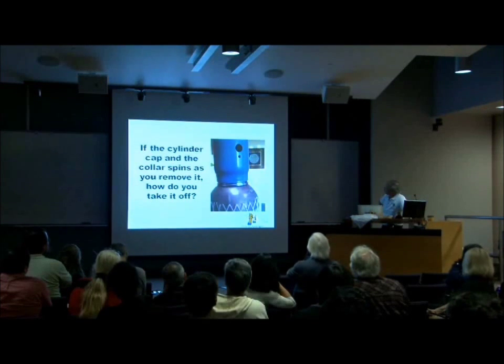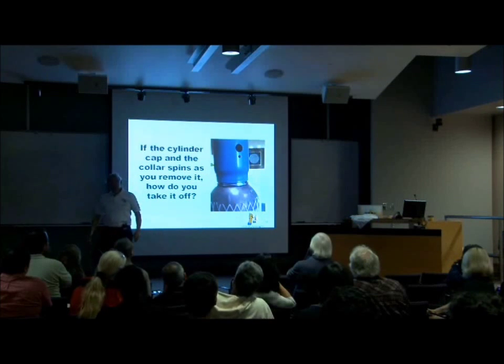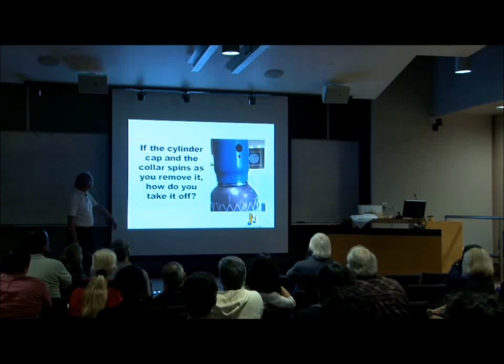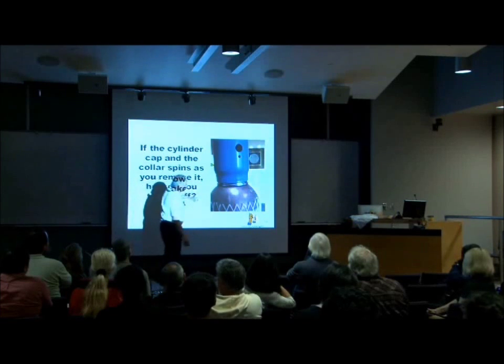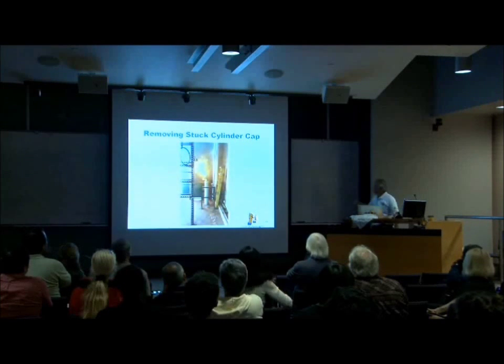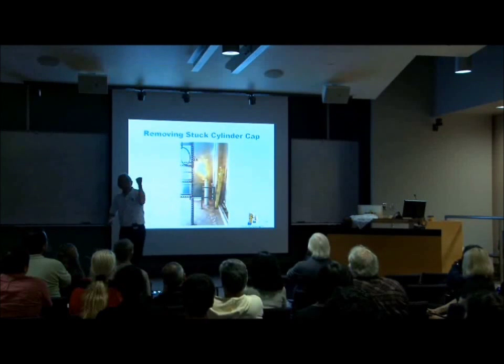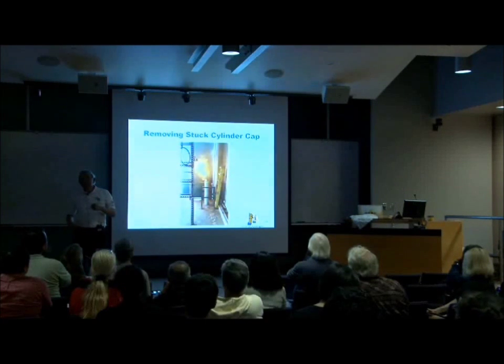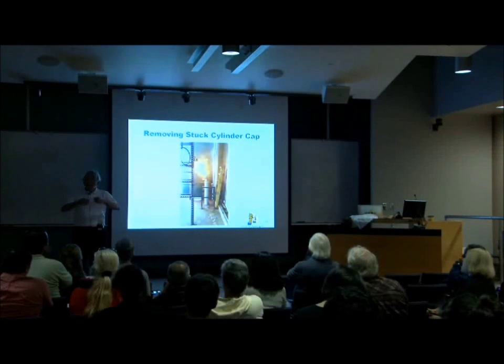Cylinder caps are performance tested. So, you got a cylinder cap, it won't come off. How do you get it off? Stick a screwdriver in that vent hole and pull it off? Oh, that's what this guy did. What happened there? When he stuck the screwdriver in, he wound up opening the handle of the silane cylinder, and now what do you got? You got a stuck cylinder cap, and you got flames coming out of the cylinder.